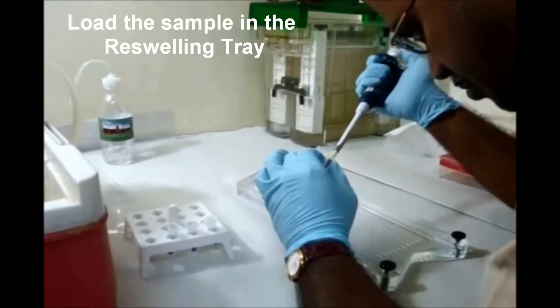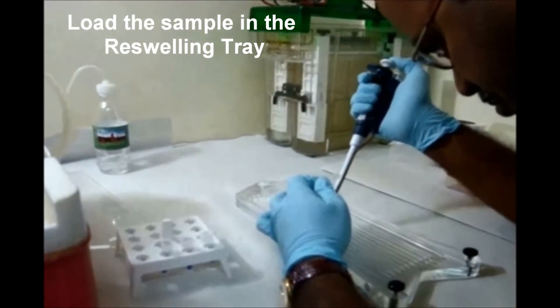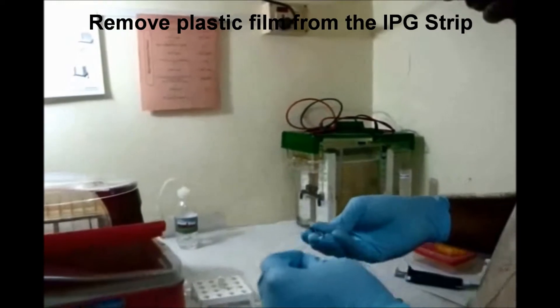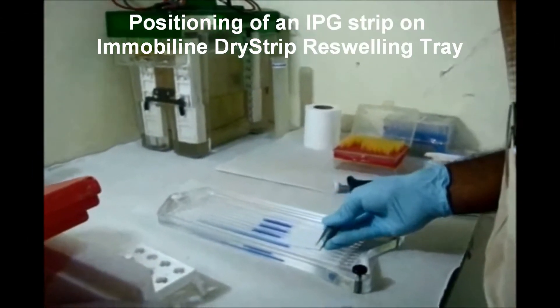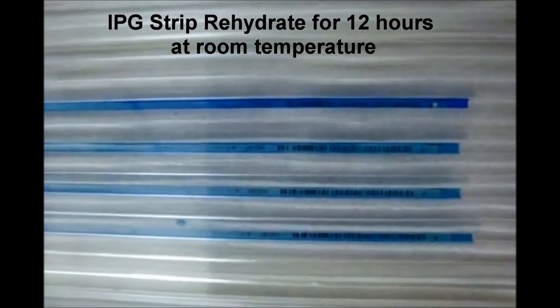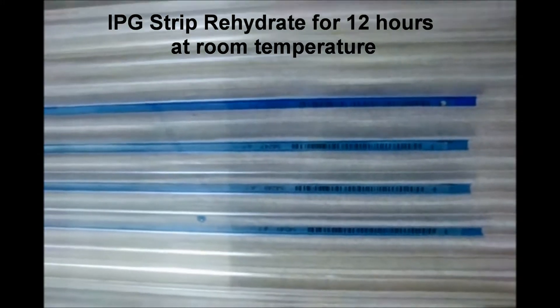Load the sample in the reswelling tray. Remove the plastic film from the IPG strip. Position the IPG strip on the Immobiline dry strip reswelling tray. The length of the IPG strip is 18 cm, pH 4 to 7. Allow the IPG strip to rehydrate for 12 hours at room temperature.